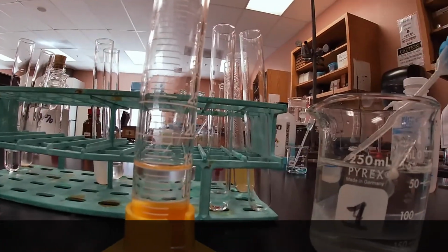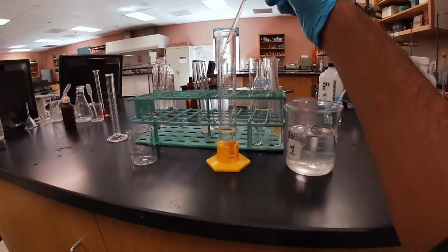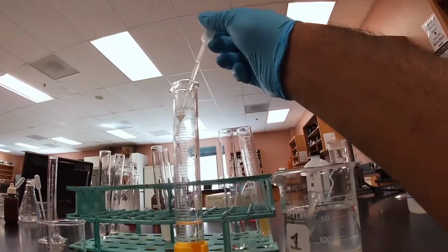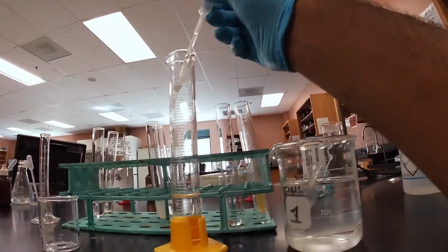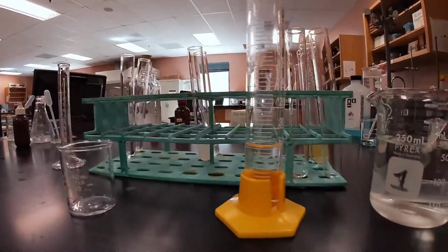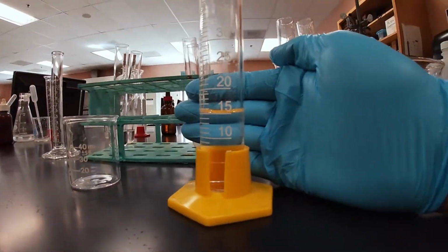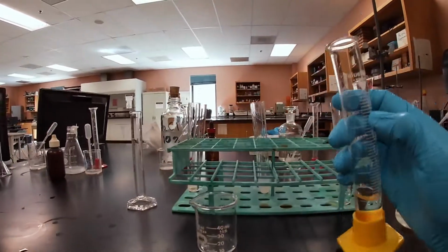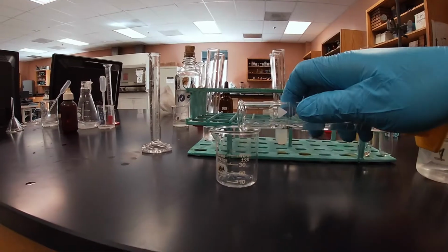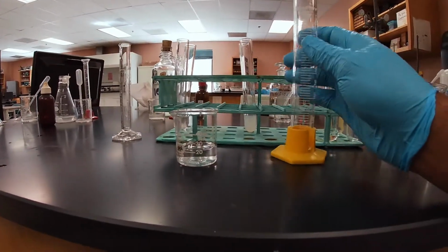And then I'll pipette the rest of the way, enough to be at about 15. I think we're good there. And so as you can see, at about 15 milliliters, we're gonna put it into our beaker. This is after 30 minutes, the contents outside of it.